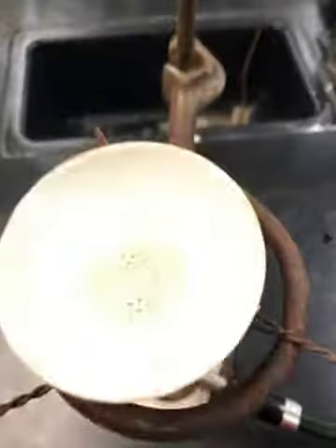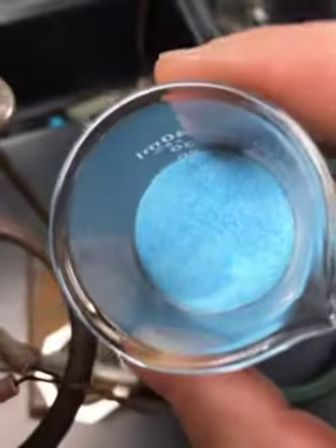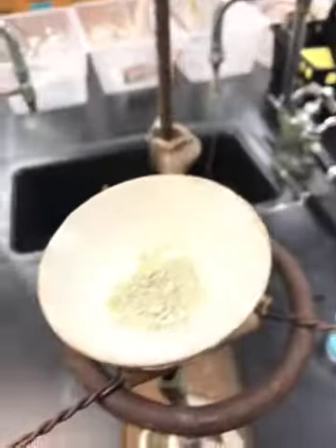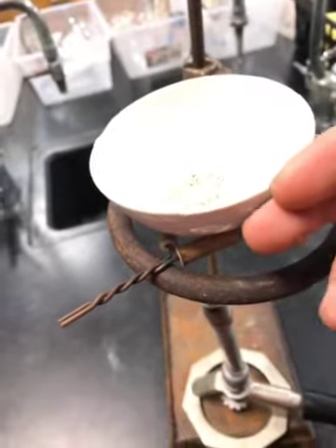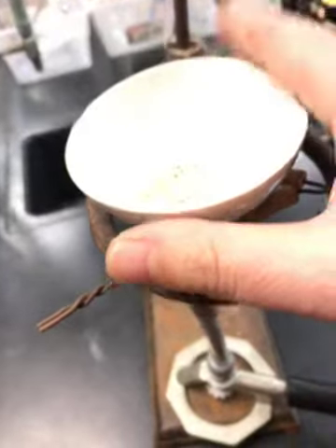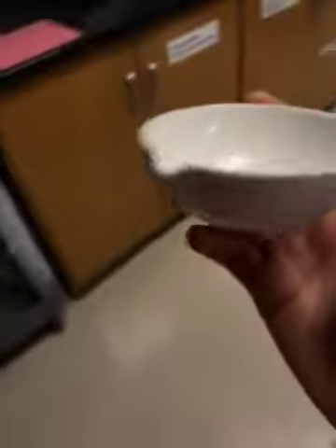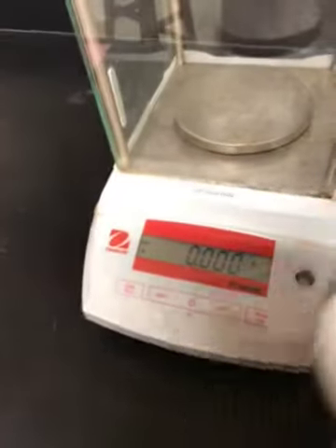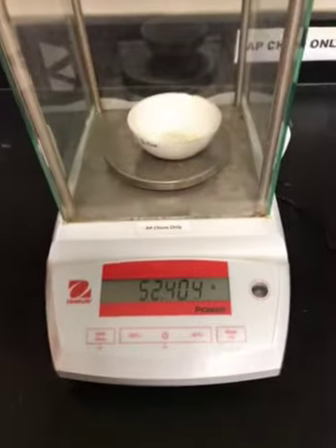All right, so it has been heating for 5 minutes, and then I let it cool for another 5 minutes. And just so you can compare here, here's the hydrated blue color, and here's the anhydrous. So to check if it's cool enough or not, you put the back of your hand close to it, and if you don't feel very much heat, then you can get a little closer and a little bit closer. And you can only mass it when it's cool to the touch. So I'm going to go ahead and mass it now. So go ahead and record.